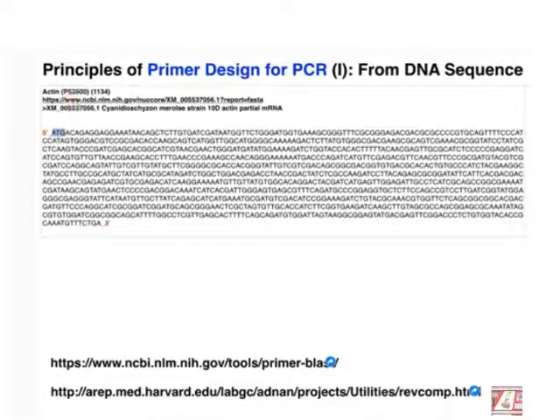And we can tell this is a gene for the actin, or in general we can tell this is a gene because it has the T, so it refers to the DNA. And also the first three nucleotides are ATG.